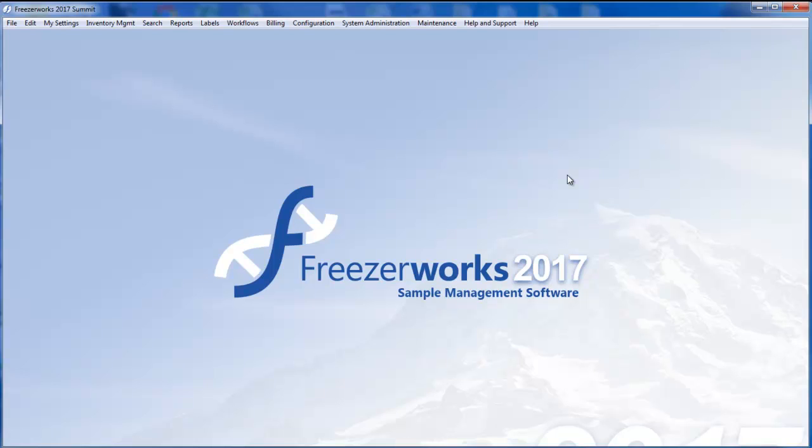In our last couple videos, we mostly glossed over updating freezer positions through workflows, as it is somewhat self-explanatory, and the one confusing bit needs a little more time to cover. That confusing part is using the freezer position tools in checkout and check-in workflows in tandem in order to maintain static aliquot positions across freezer changes.